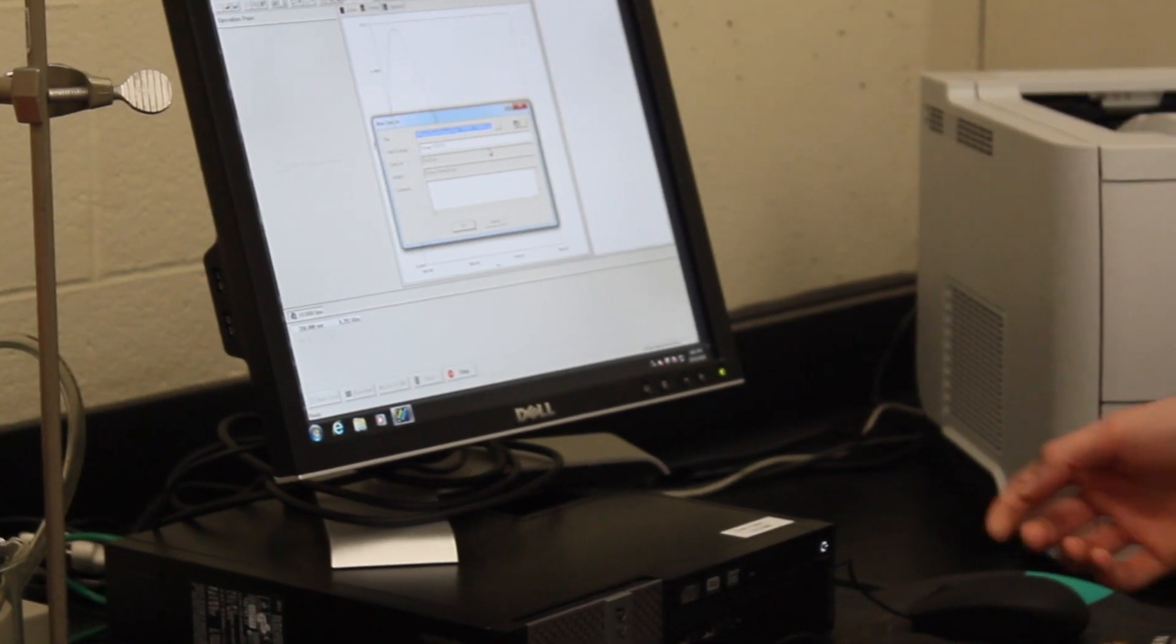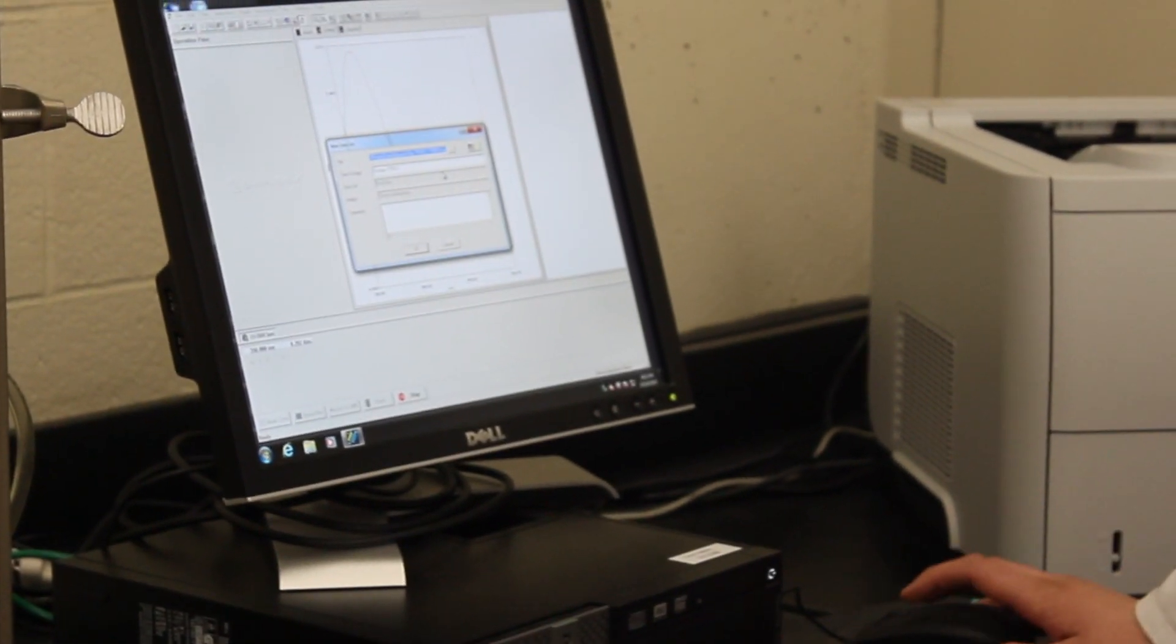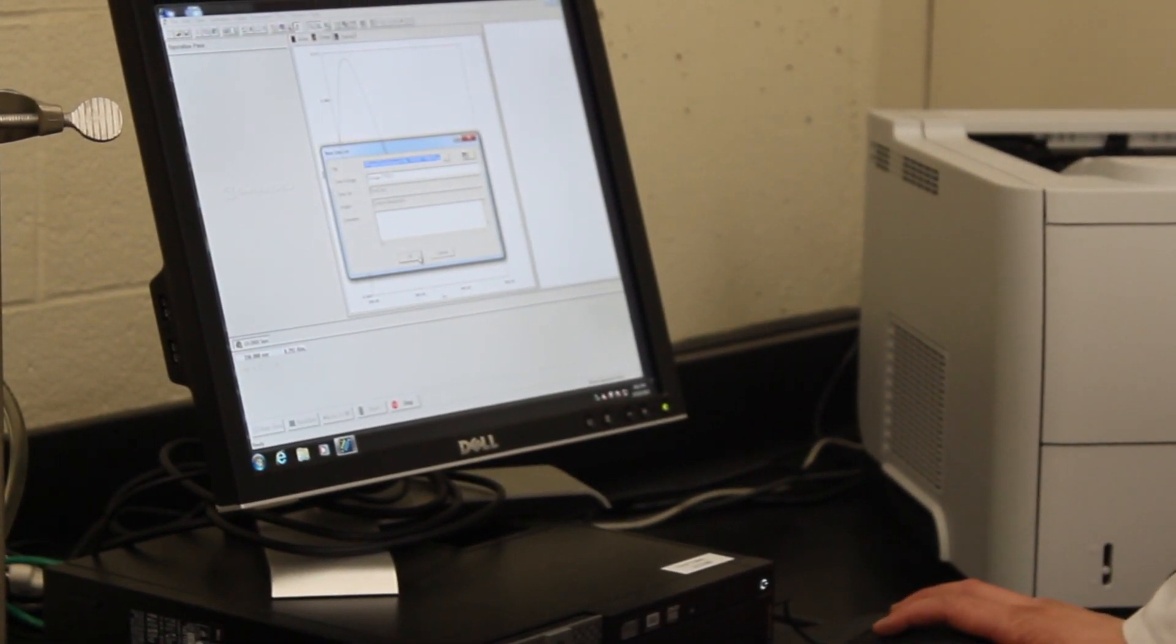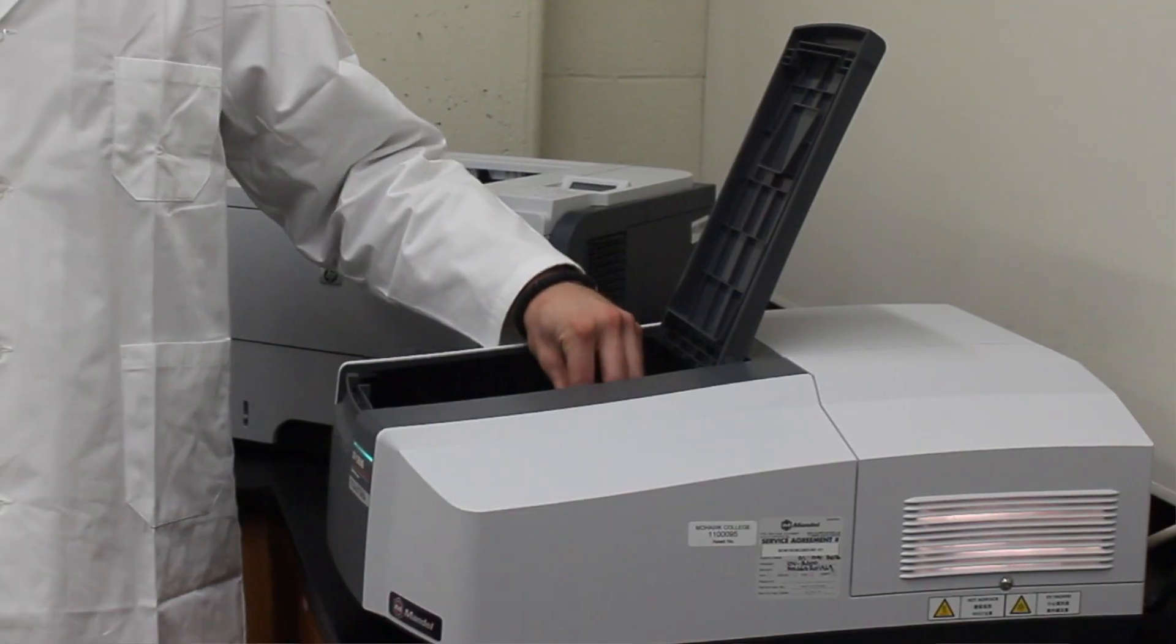This machine is called a UV-vis spectrophotometer. Basically, this machine can analyze samples using ultraviolet and visible light. Ultraviolet light is just above our visible spectrum that we can see with our naked eye.